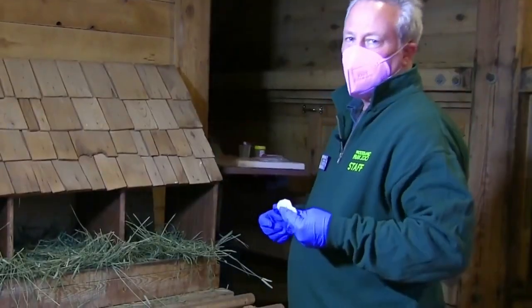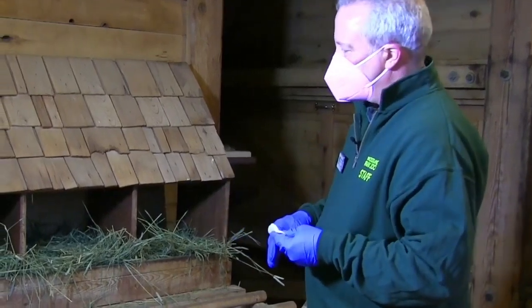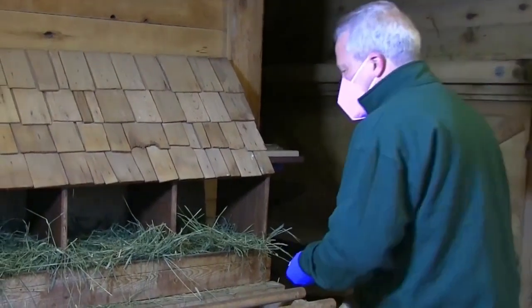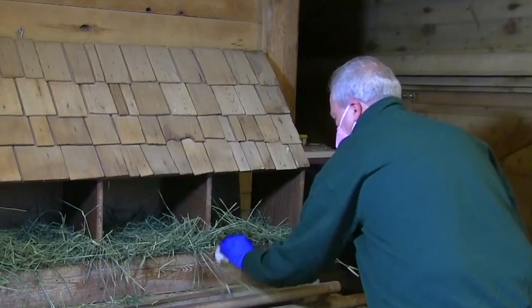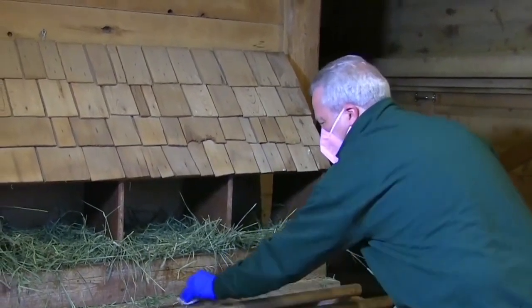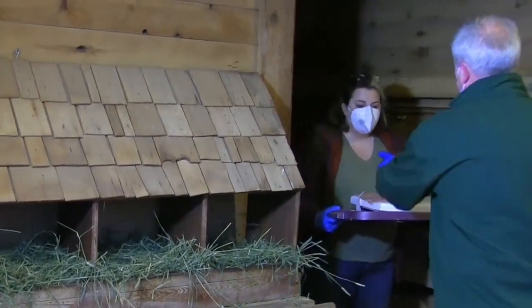Next, I'm going to take a sample of the housing or bedding area where the chickens like to hang out. I'm going to take my sterile gauze, already moistened, and swipe along their house — the area where they like to lay — get some of the bedding, and then take that soiled sample and put it in my sterile container.